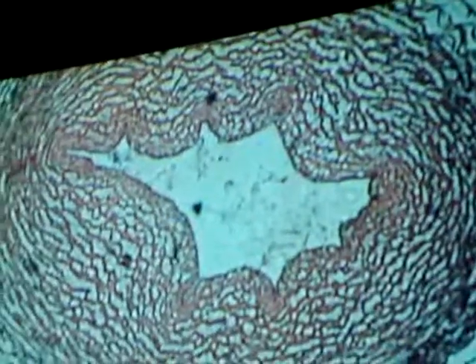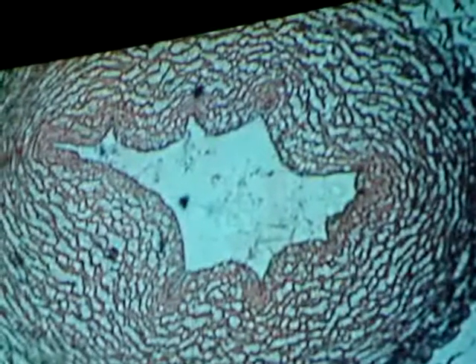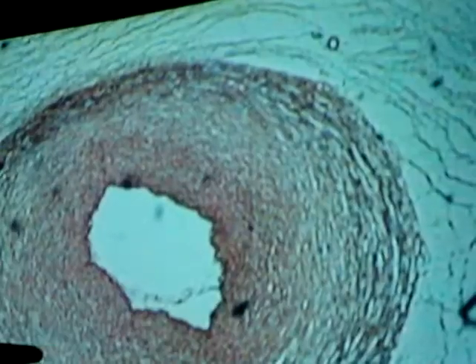deoxygenated versus oxygenated blood. The arteries are still more compact together. The veins are still more spread out and have kind of a more irregular shape to it. So umbilical vein, umbilical artery, and umbilical artery. And again, I can see them side by side in the field of view. So they could be side by side there. Wharton's jelly again is all the interior, and on the outside the amniotic epithelium.